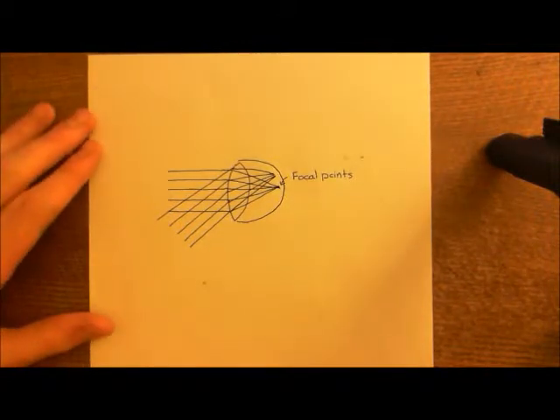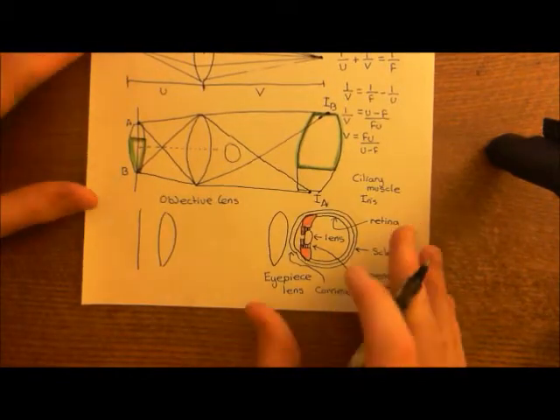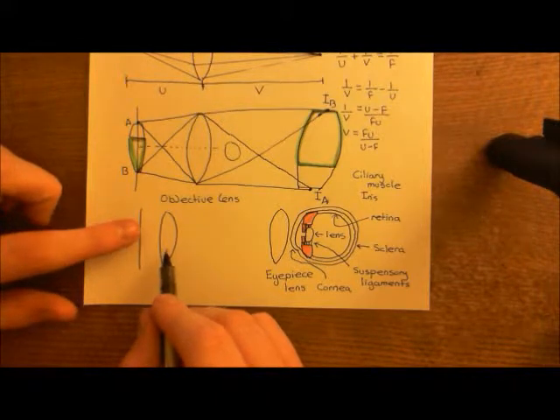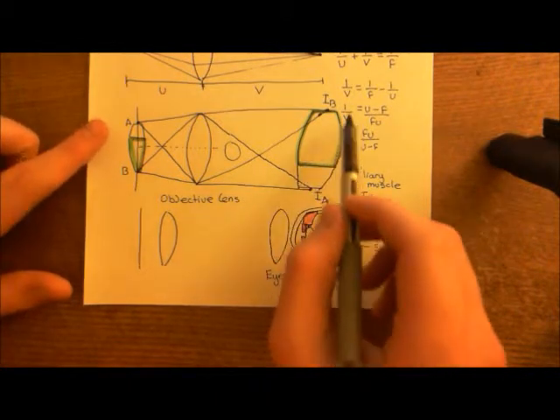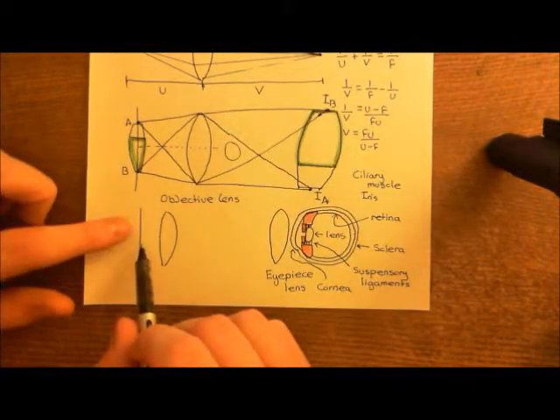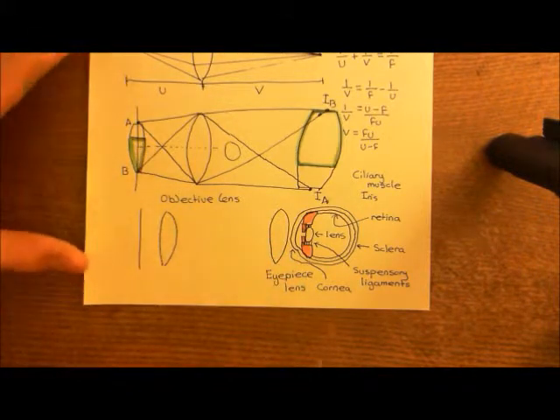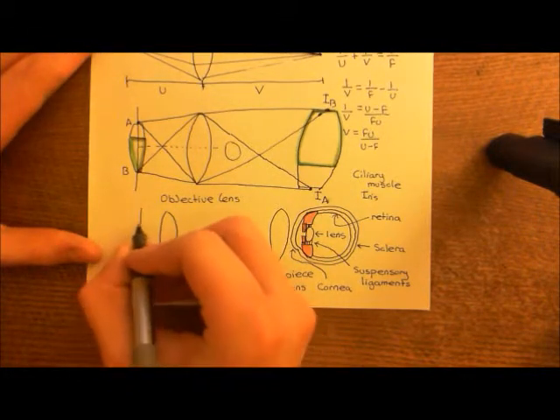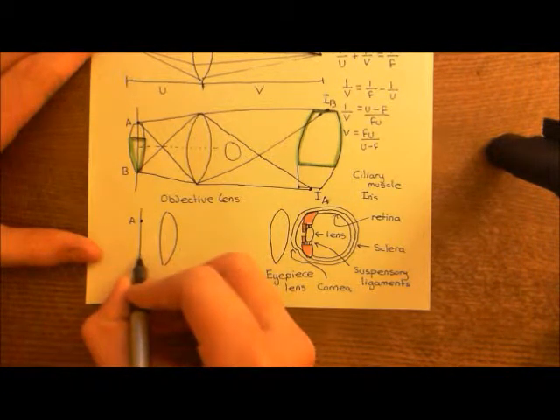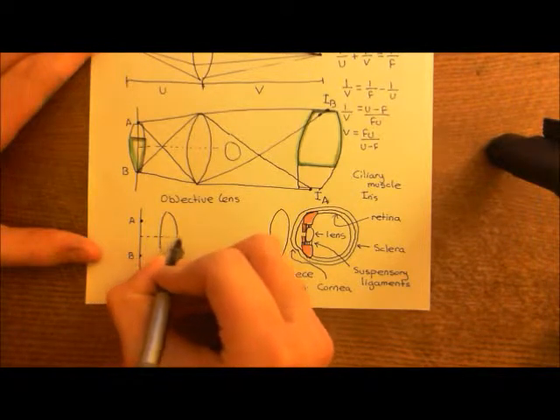So back to our drawing of the compound microscope. Let's start with the objective lens. What the objective lens is going to do is hugely magnify the image. It's going to do exactly what we have here, except that we are now dealing with some microscopic slide rather than a highlighter pen. Let's say we again have 2 points: point A is here and point B is here, and then there's some portion in the middle.